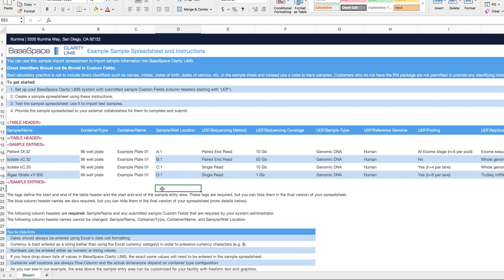If you are submitting samples in tubes, you can leave the container name and container location blank. Once you have filled in all of the fields, you can save the template and upload it to your project.